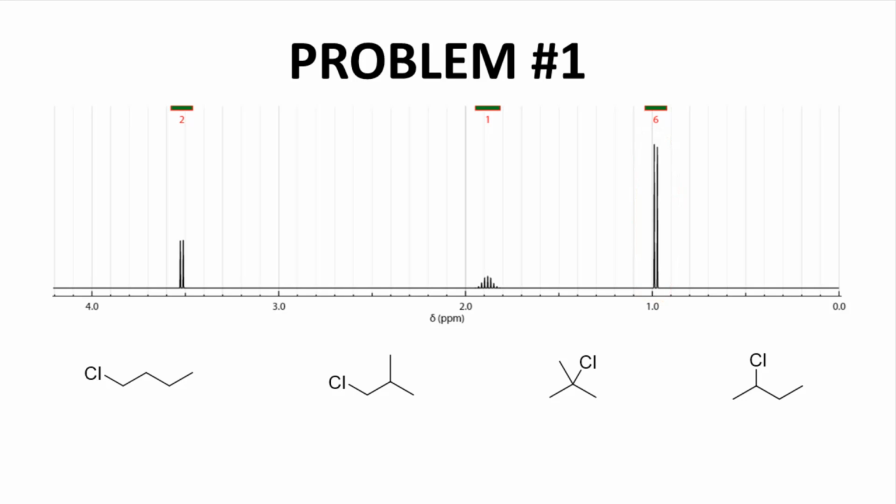Our first structure on the left, this molecule should have this CH2, maybe that's signal A, B, C, D. So on first glance, this leftmost molecule looks like it should have 4 signals. It's not guaranteed, but that's what it looks like at first glance. I don't think this spectrum matches this first molecule because our spectrum has 3 signals. So let's tentatively eliminate this structure.